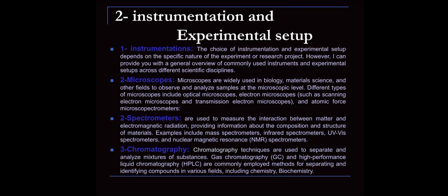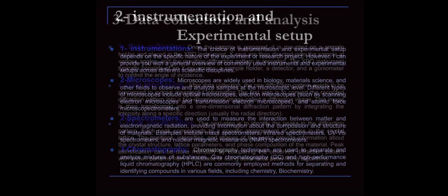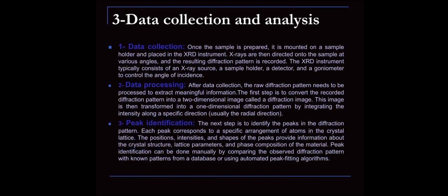Third, chromatography. Chromatography techniques are used to separate and analyze mixtures of substances. Gas chromatography and high performance liquid chromatography are commonly employed methods for separating and identifying compounds in various fields, including chemistry and biochemistry. Third one, data collection and analysis.